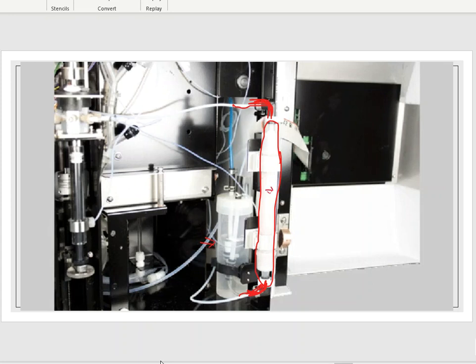So very often you will see this thing called flow, and there'll be an arrow on it, all right? And it will tell you which way that you are supposed to point this halogen scrubber in. So you can't just flip it around any way that you want to flip it around. It's not universal, so to speak. You really do want to keep it in the same location, keep it in the same flow, keep it in the same direction, because that's going to be very important later on when you begin to determine if you need to replace this thing or not.